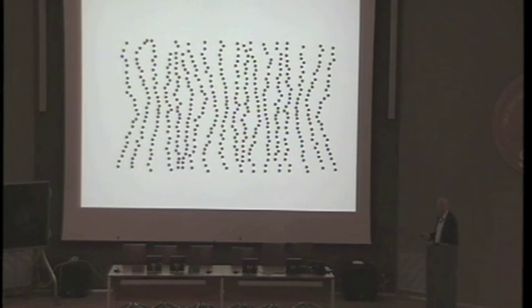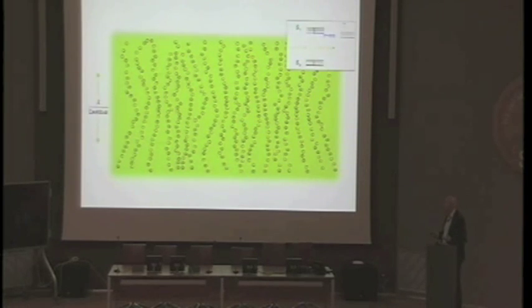Now, in a fluorescence microscope, the molecules are labeled. So there is a dye placed on the molecule, or a GFP, so perhaps genetically encoded even. And then these fluorescent molecules have two basic states, a ground state here and an excited state.